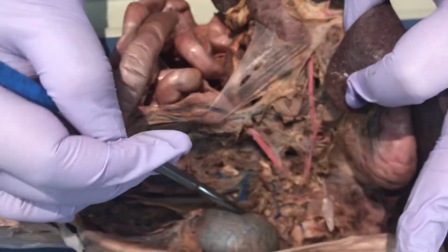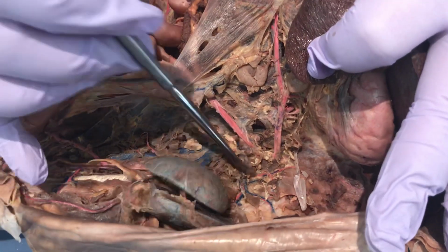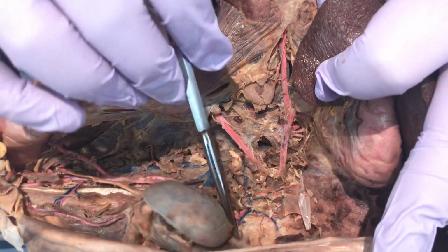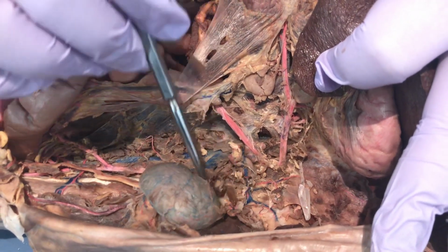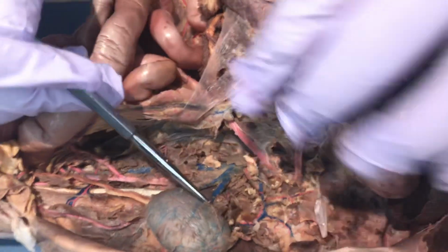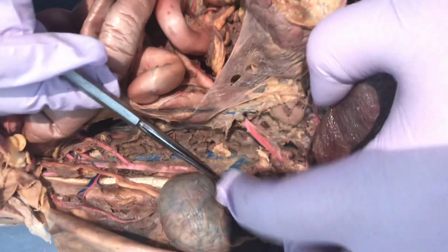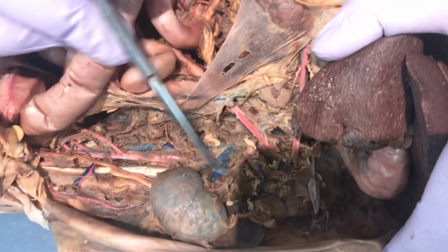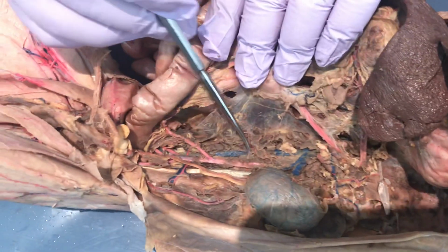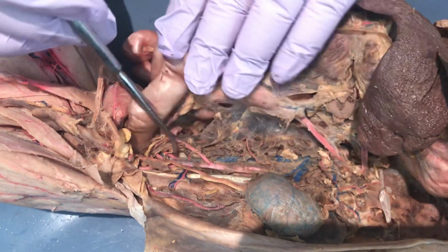All right, on the other side, we have that little adrenal gland. So the artery and vein that pass through here are the adrenal lumbar artery and vein. Going towards the kidney is the renal artery, which mine did not dye well, it's got stuff all over it. Renal artery. This is all that abdominal aorta.